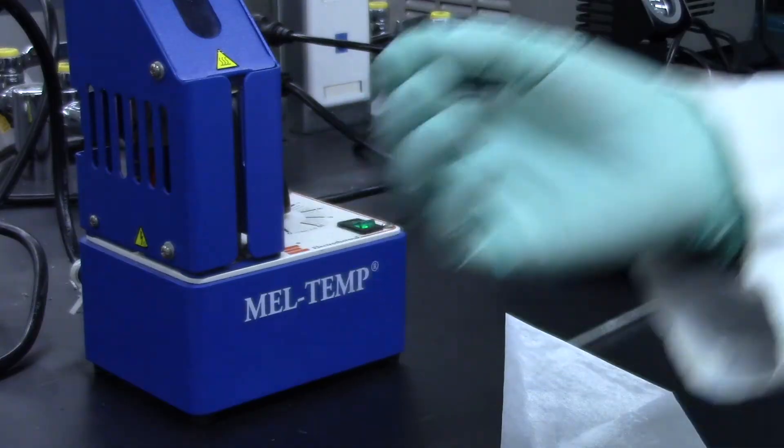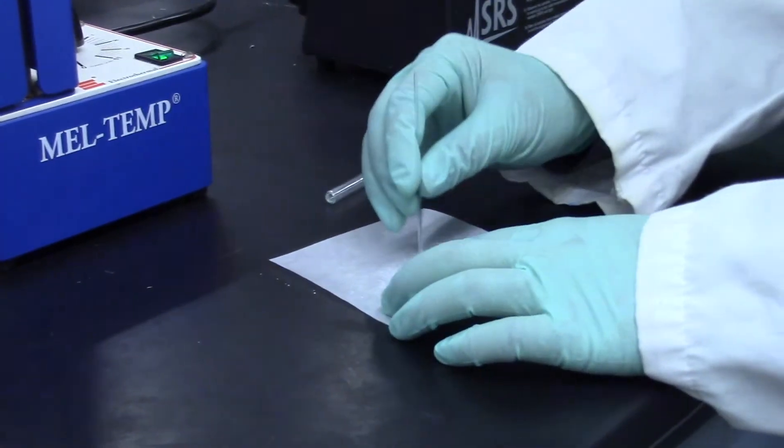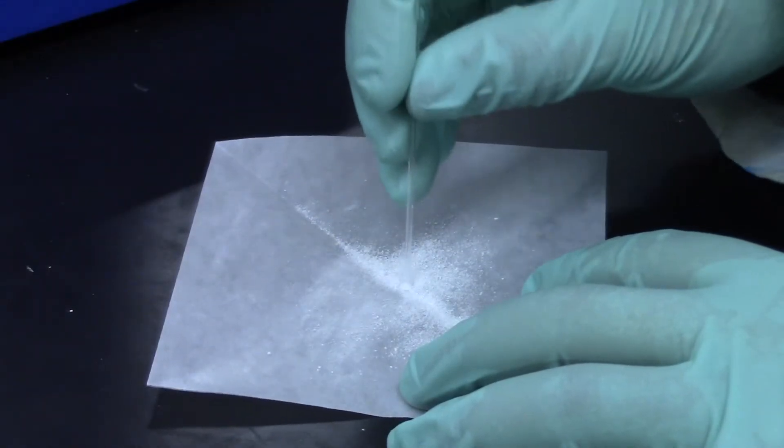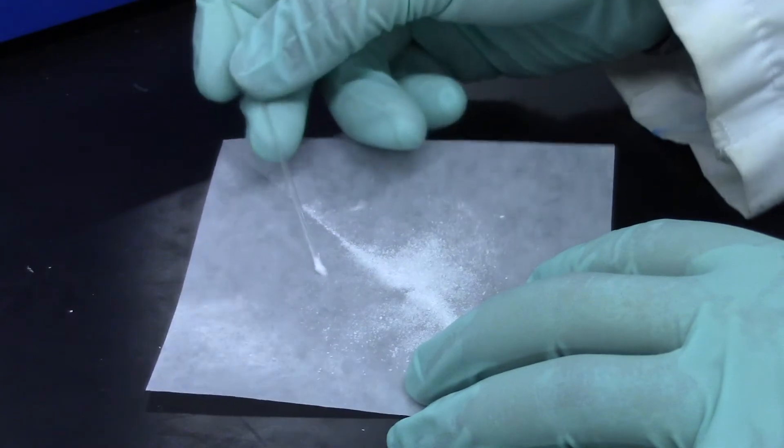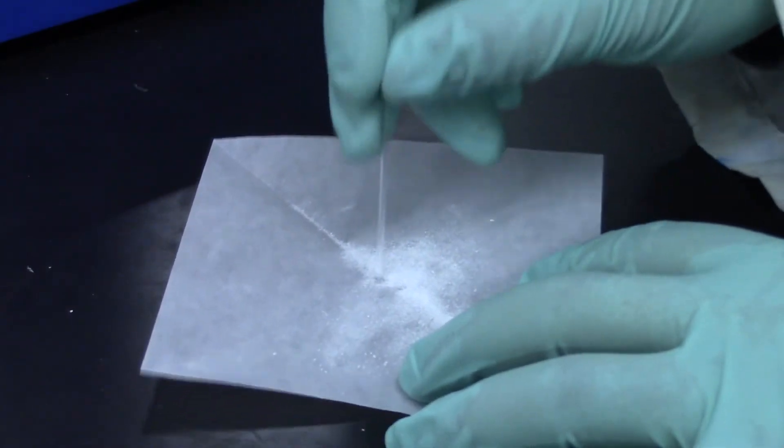Once the powder has been prepared, stamp capillary tubes. Make sure you use the tubes where one end is closed onto the substance. Two or three stamps normally add enough of the substance into the tube.